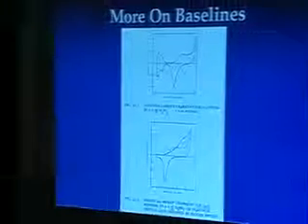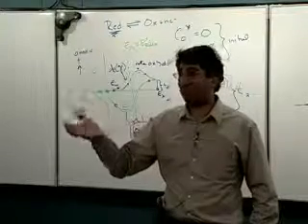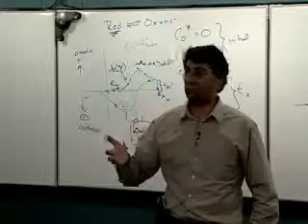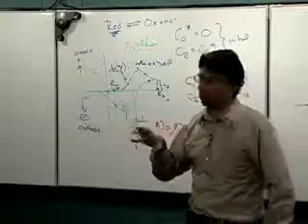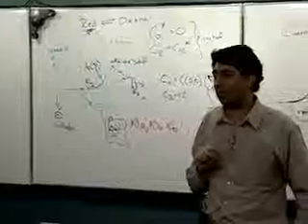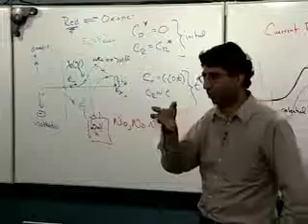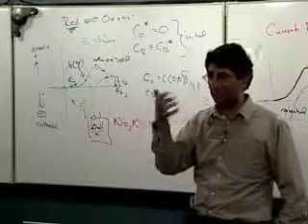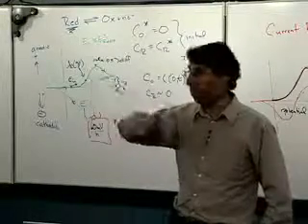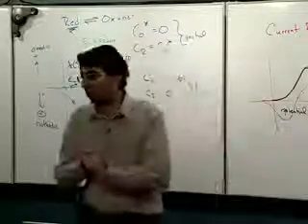These equations that we're dealing with, I lost my peak current equation, didn't I? Well, you'll recall that the peak current is linear in bulk concentration. If you have chemisorption, that will no longer be the case. So typically, in a chemisorptive system, you start at very low concentration, and you start to see the linear dependence of peak current developing, because you don't have enough material yet to really chemisorb a lot of material on the electrode surface. But at some point, the chemisorption starts, and you saturate the surface with a monolayer or whatever it is of this material, and you lose your linear plot.